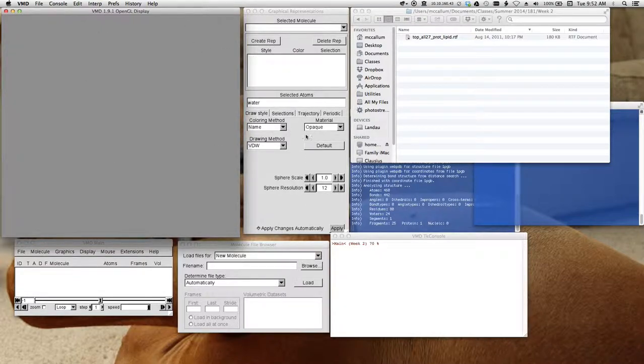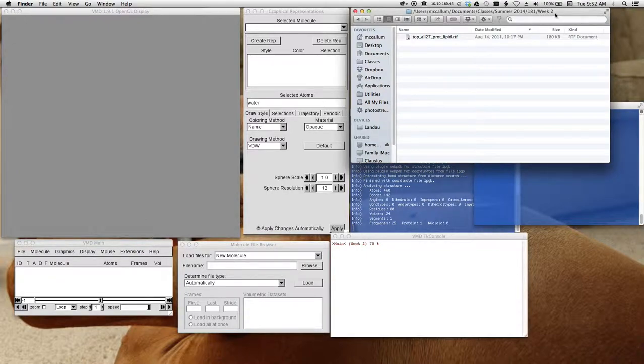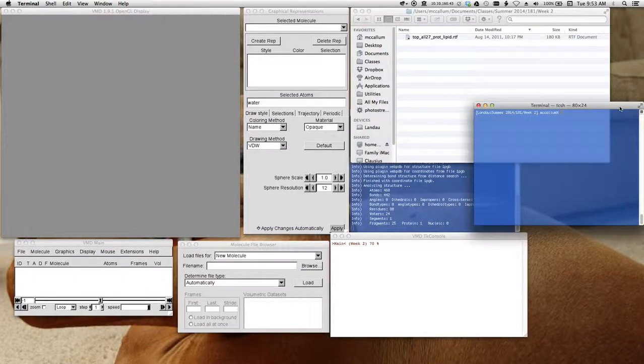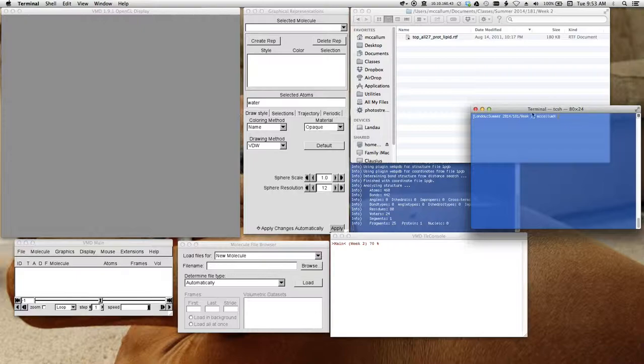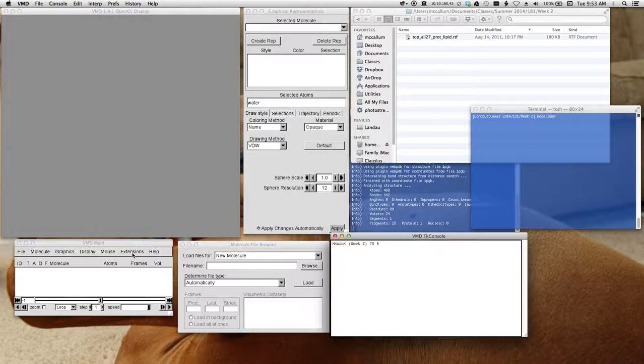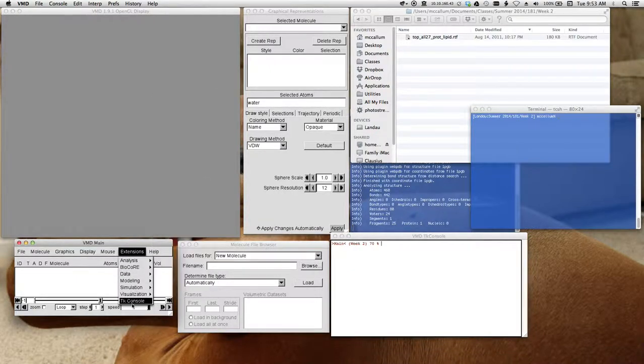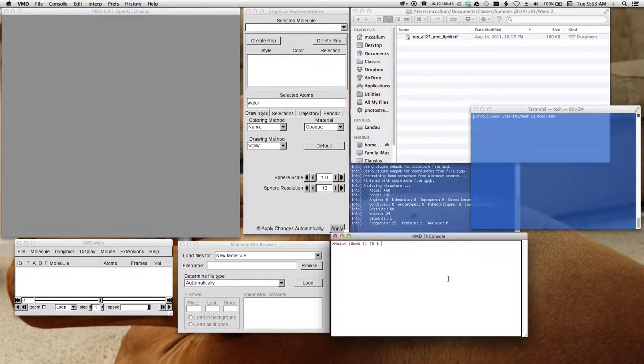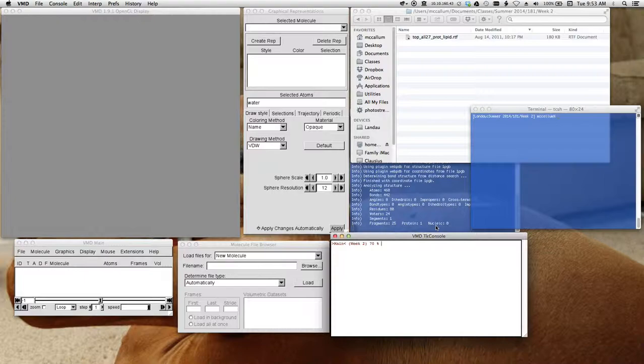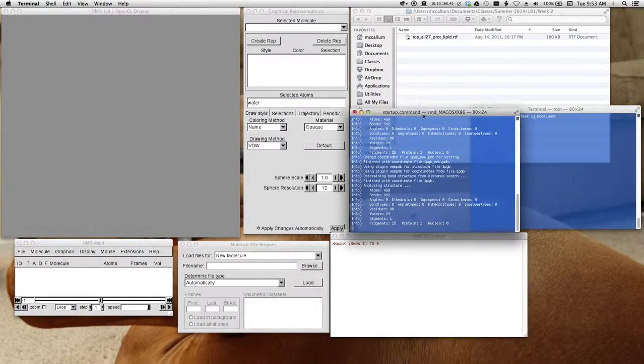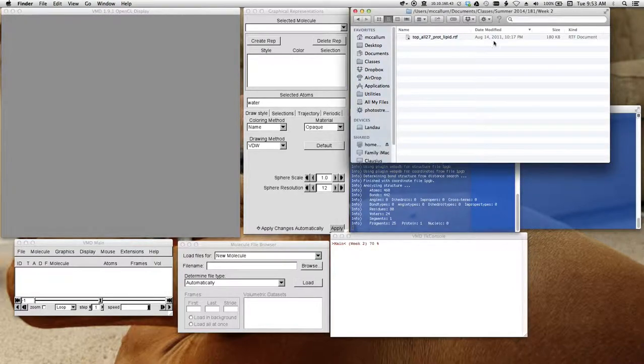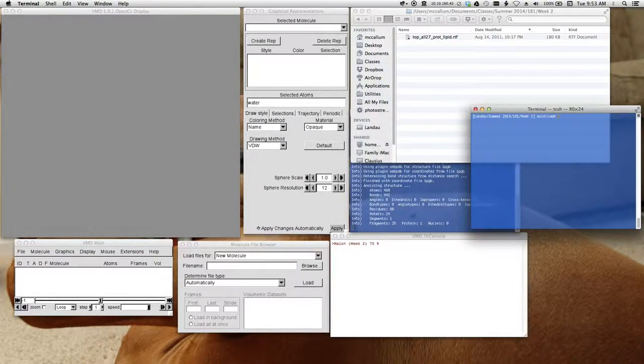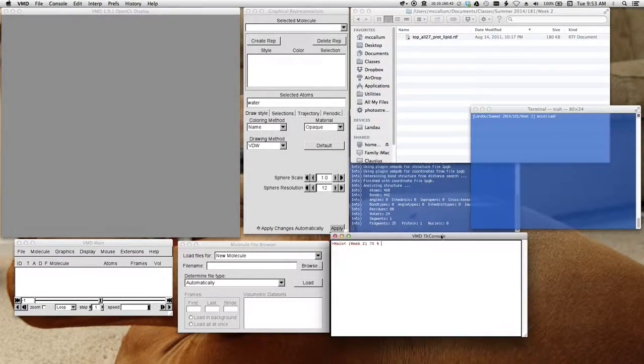Notice what I have here. I have my windows all arranged. I have a finder window, which is sitting in the directory, which happens to be called week two, that I'm working in. I have a terminal window. This is a normal terminal. It's also in that directory. I've opened up the TKCON, and it's also in that directory. When I'm in a terminal or a TKCON, I can use the CD command to change the directory to the directory I want to be in. This is the VMD messaging window, useful in case VMD needs to tell me anything.